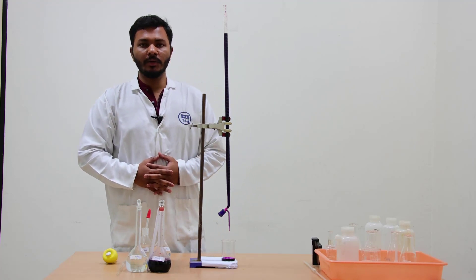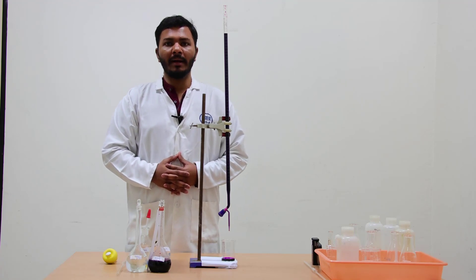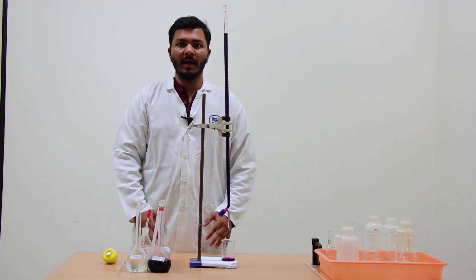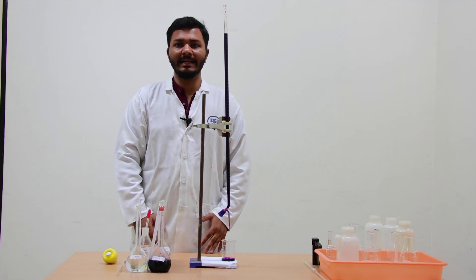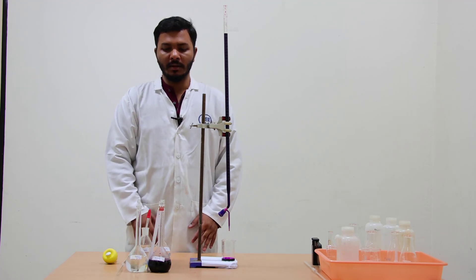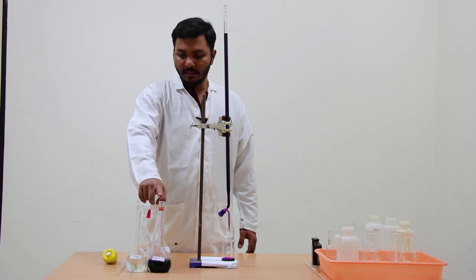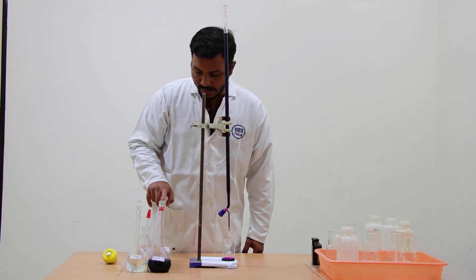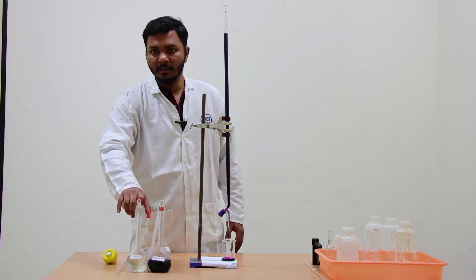In the previous class, Dr. Raj Chudri performed the standardization of potassium permanganate using primary standard oxalic acid. In this class we have to perform a new reaction: determining the concentration of Fe2+ present in the N/10 Mohr's salt solution. The required reagents are potassium permanganate, 4 normal H2SO4, and N/10 Mohr's salt.